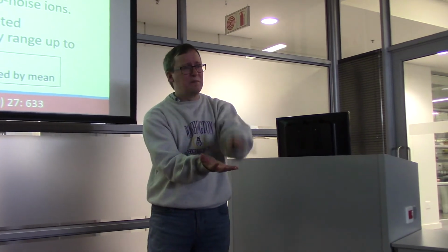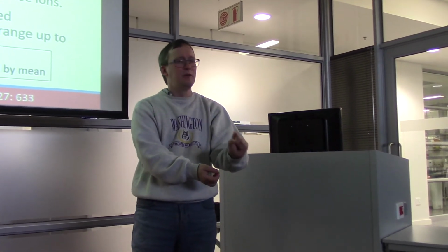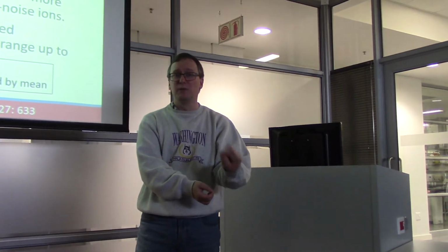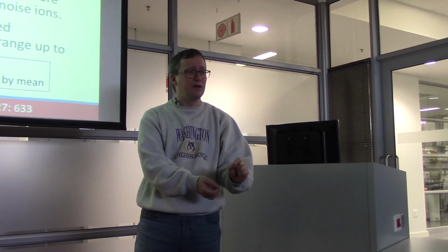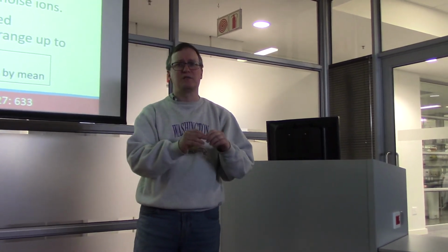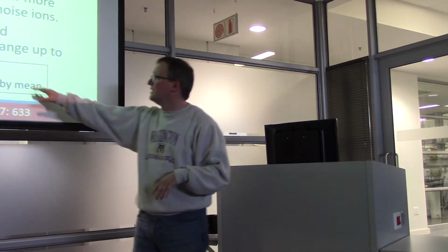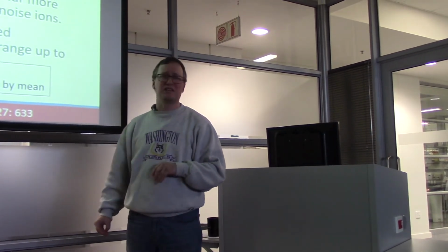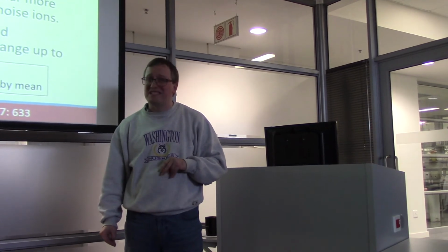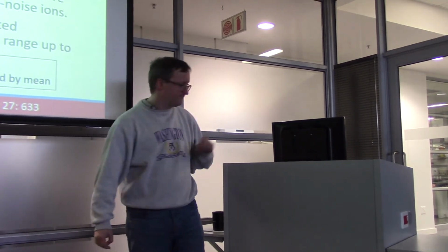When you have a peptide that's a very, very minor constituent of a sample, your ability to quantify that well is much reduced. It's far better for you if you're able to quantify that peptide in a context where it's not being overshouted by everything else in the sample. So you can expect a 10% CV to be about the best case of what you're going to get from mass spectrometry quantitation.